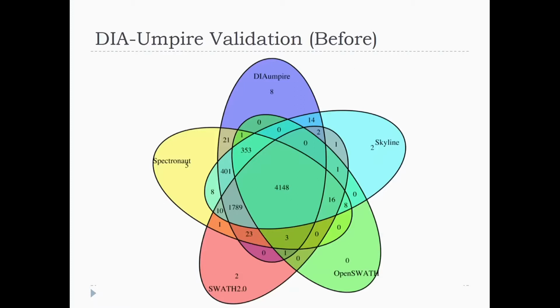Is there anybody who's like, hey, why did my tool get this? Okay, I add this circle. What's that circle? And who doesn't get those? OpenSWATH, right? And do you see any other tool with a similar scale of missed things? No. So why was OpenSWATH suddenly doing so terrible?